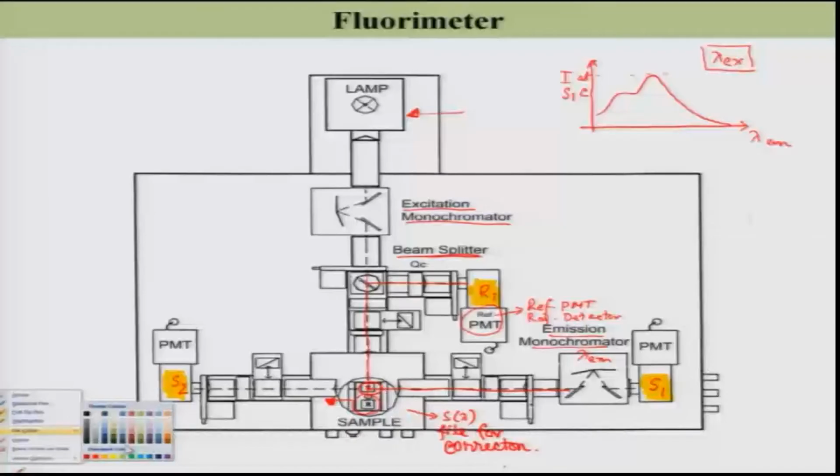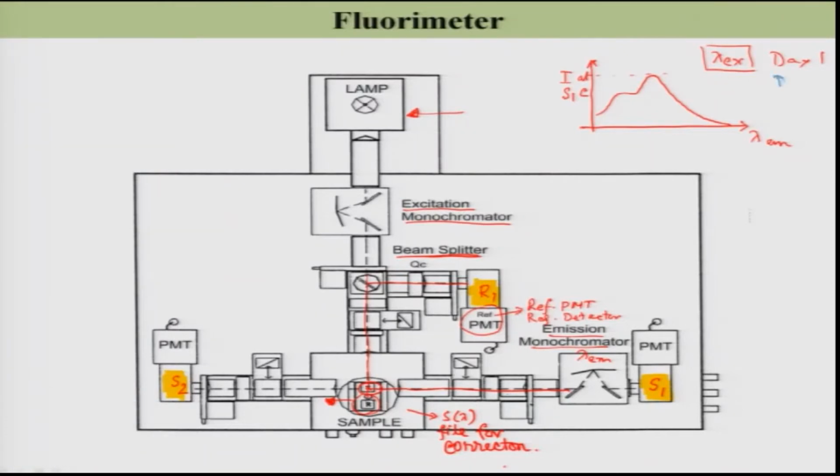So, this is day 1. Next day, day 2, you use the same lambda excitation, same S1C by R1 plotted versus lambda emission.